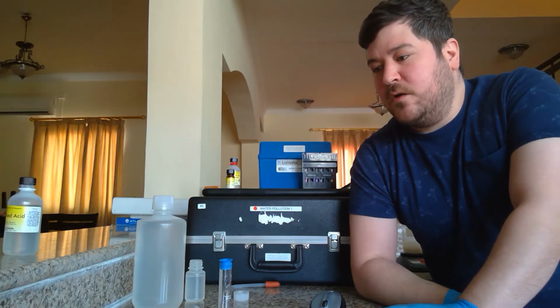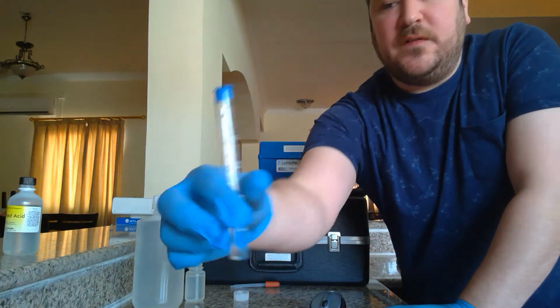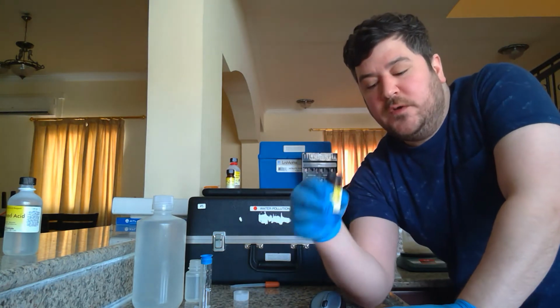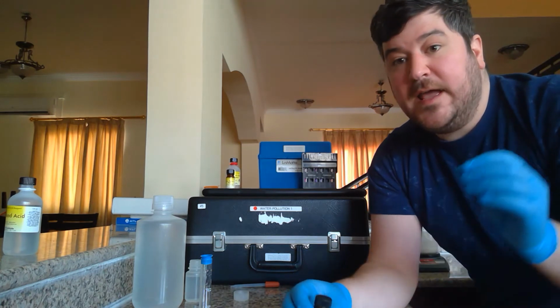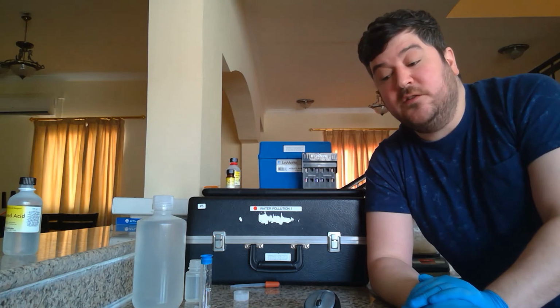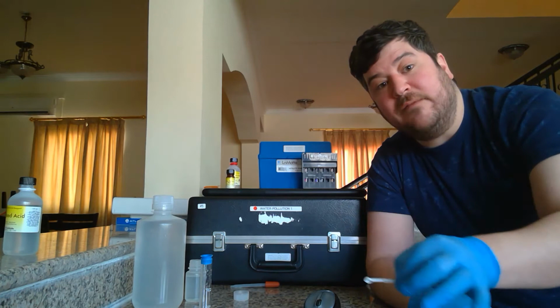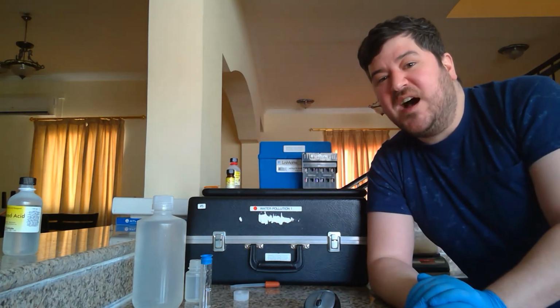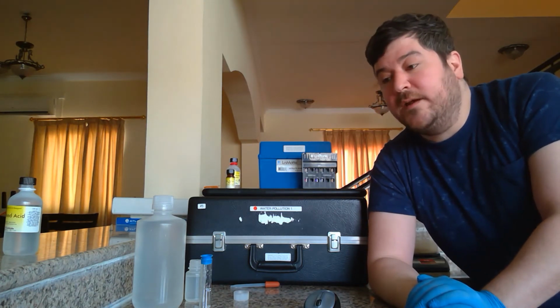It's been about 2 minutes, and I have the top on this. It's capped, as you can see, and the next step here is to add 1 scoop. It comes with its own little scoop of nitrate reagent, and it's 0.1 grams of nitrate reagent. It mentions in the procedure to make sure you don't add any extra. So I'm going to scoop and level this off, kind of like when you're baking, to put this in here. I then have to shake it 60 times in 1 minute and then wait another 10 minutes.